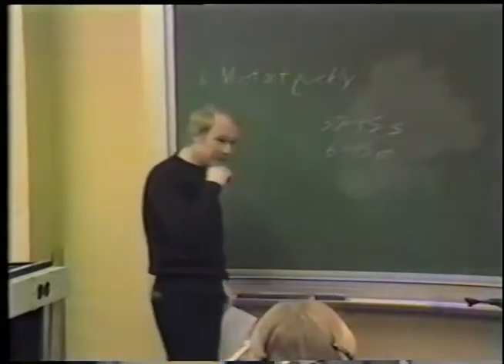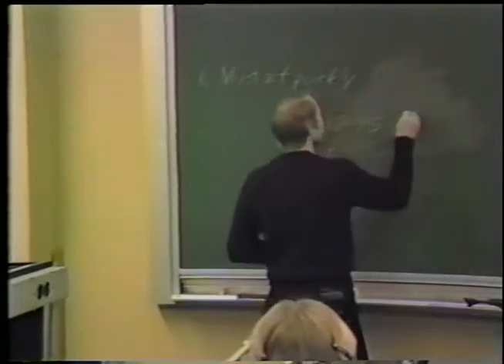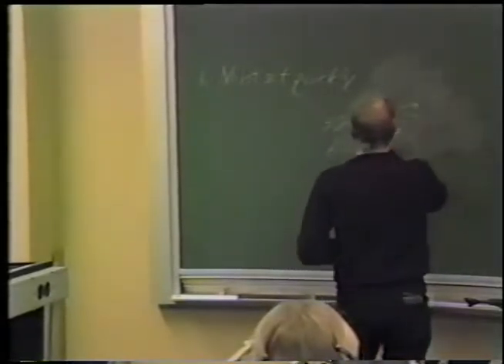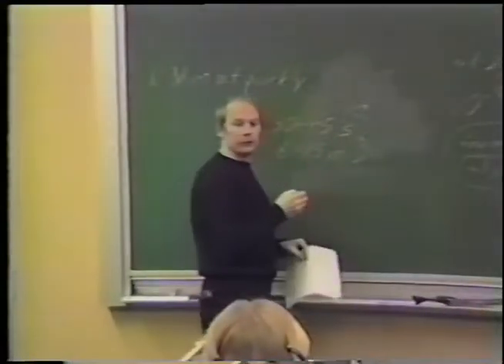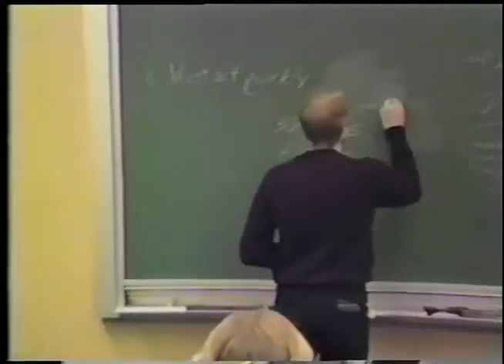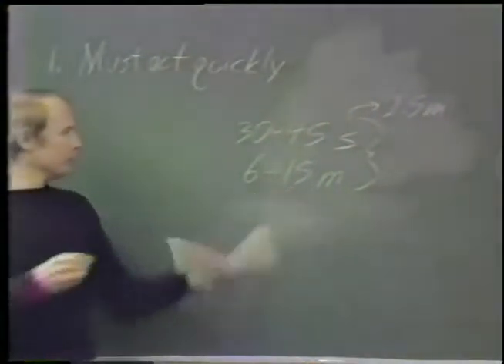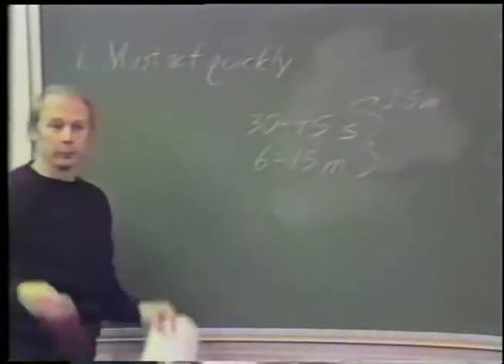It's very slow. And in this case, after all the cytoplasmic inclusions had stopped moving, the circulation of the endoplasmic reticulum continued for 2.5 minutes. And in this particular case, the circulation of the endoplasmic reticulum was occurring during the 6 to 15 minute period required to stop everything.